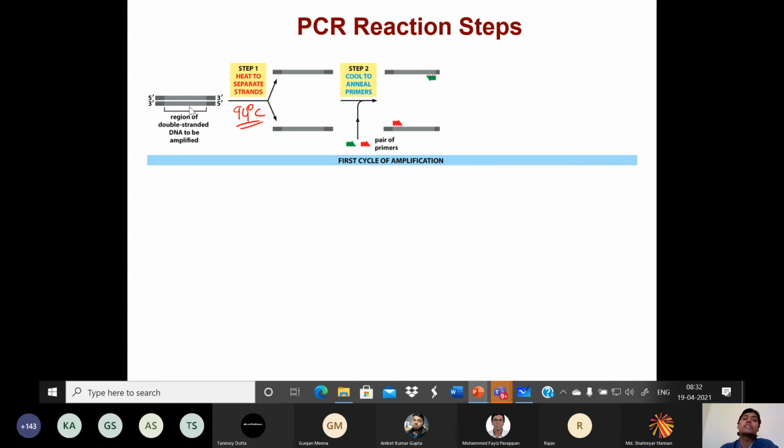Here we are showing just one double-stranded DNA at the starting point, but at the beginning you might have 50, 100, something like that. And you have a huge amount of primer, so you are actually ignoring the double strand formation between the original or parent strands.